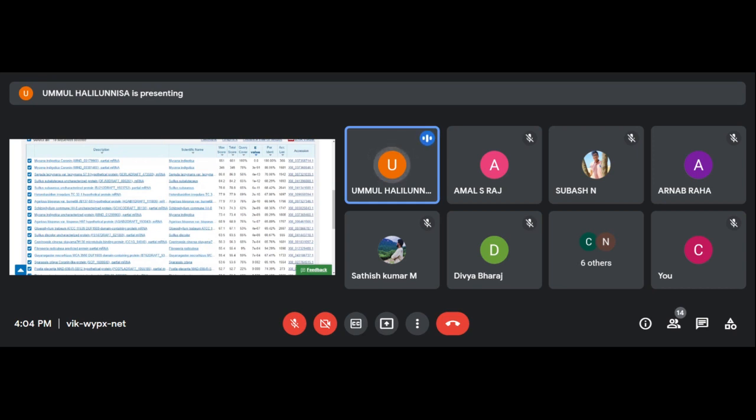If it is above the 30 percentage, it is a homologous sequence, no doubt about that. But below that, like 27%, that is up to the maximum. We will call it a twilight zone.